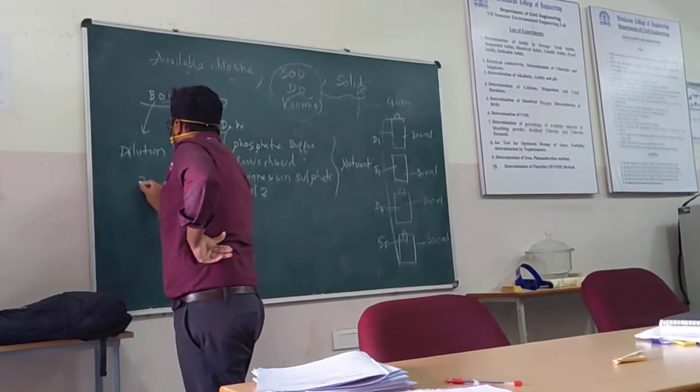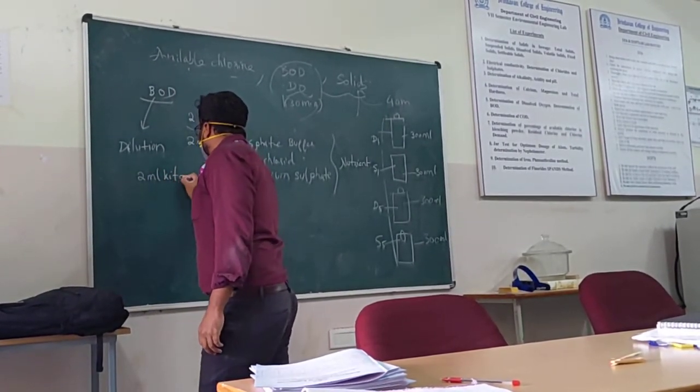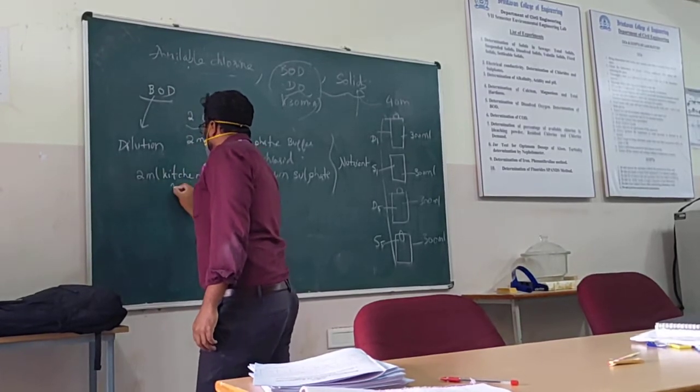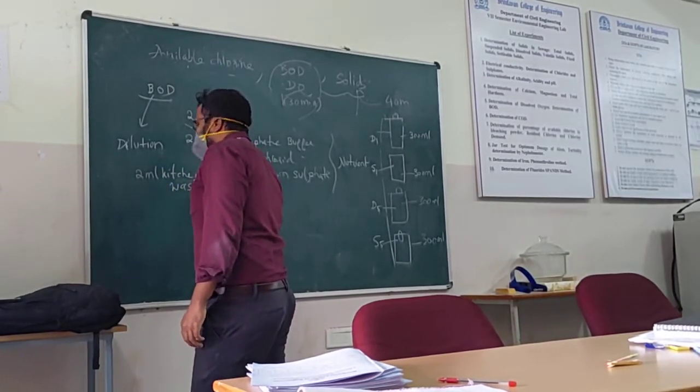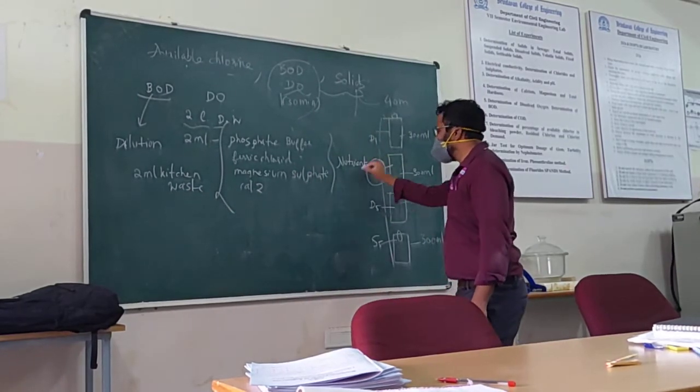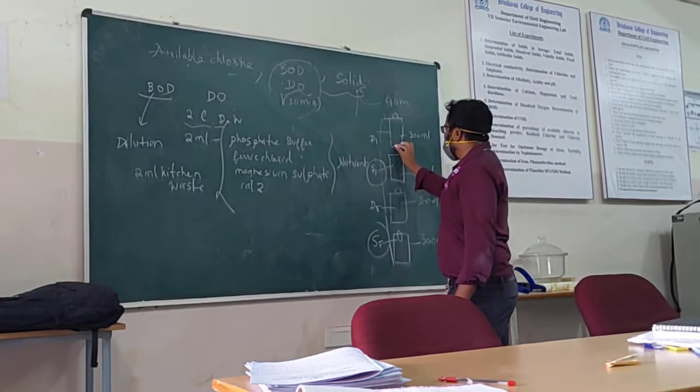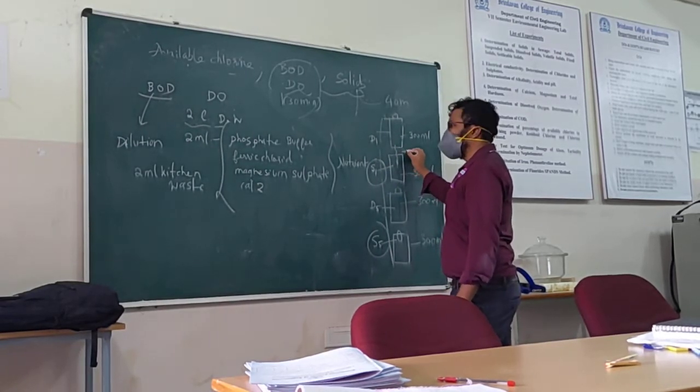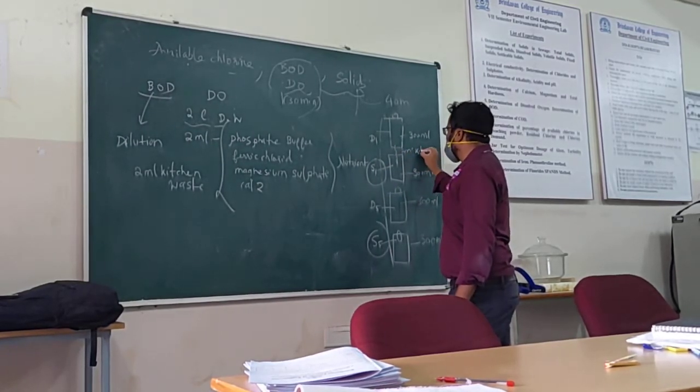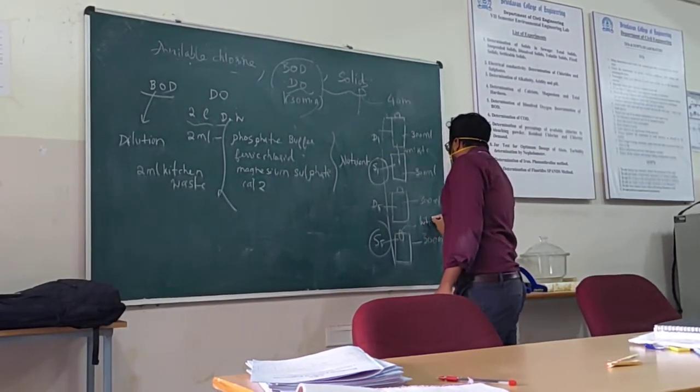So we take 2 ml of sewage sample and we will drop this to the S bottles I have. There we drop 2 ml of sewage sample. This one and this S1.